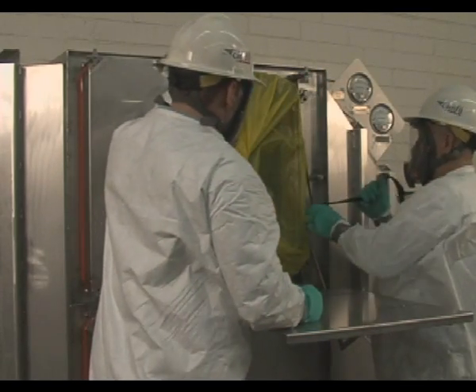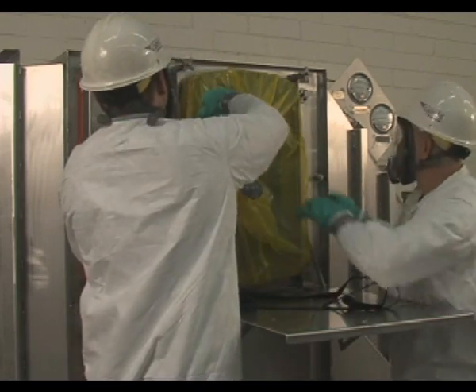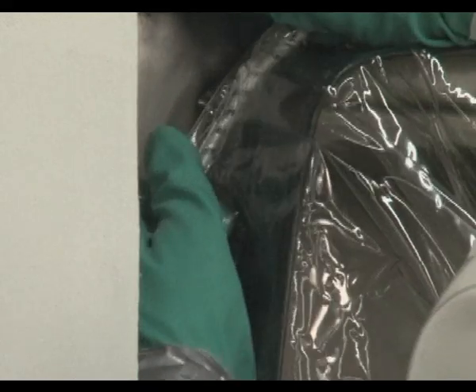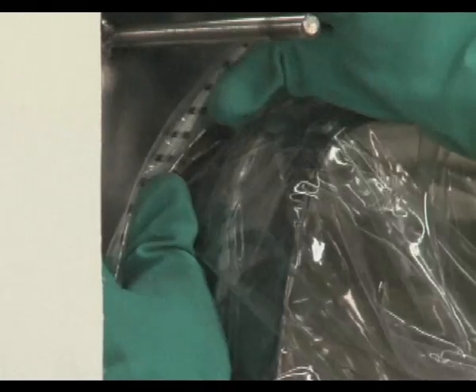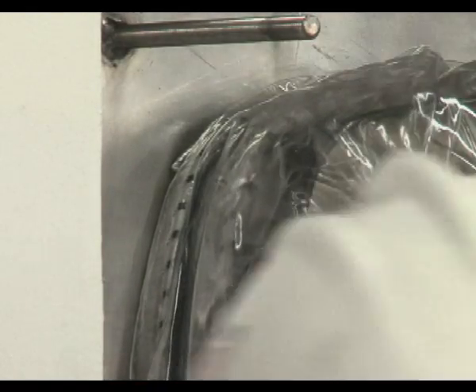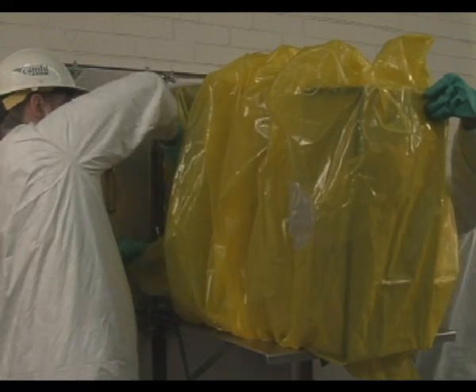Remove the change out bag security strap, leaving the stub bag on the bagging ring of the housing. Move the stub bag shock cord in between the two raised ribs on the bagging ring. If there is more than one filter to remove from the housing, place a new change out bag around the bagging ring. Locate the shock cord between the housing and the second raised rib of the bagging ring, with the seam of the bag located on top of the bagging ring.